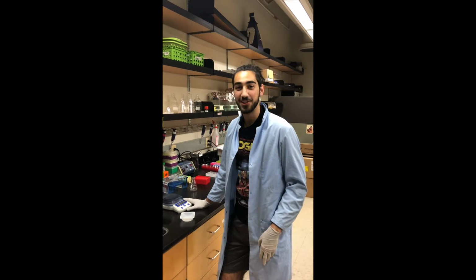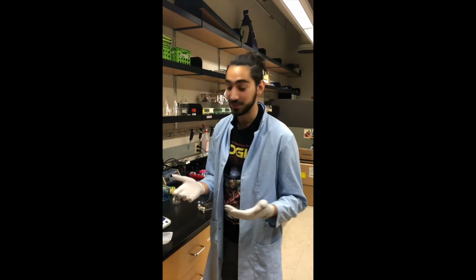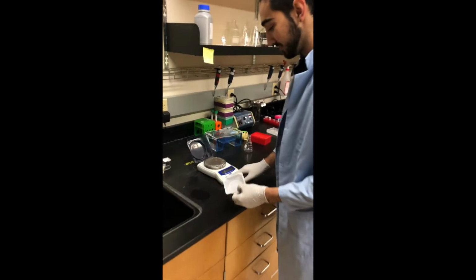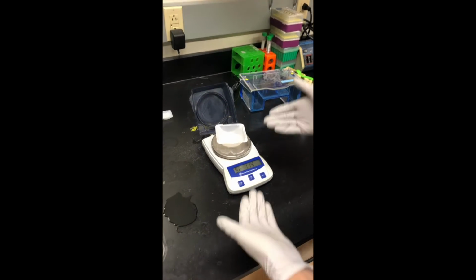Today we're going to teach you a very educational video about how to run gel electrophoresis. So the first step we're going to need to do is get some agarose, because that's the base for what your gel is made out of. We're going to open up our scale and zero it out, because we want to measure our agarose.